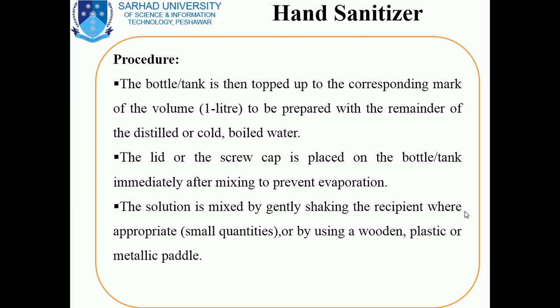The next step is the lid or the screw cap is placed on the bottle or tank immediately after mixing to prevent evaporation. In this step, the lid or the screw or the stopper will be immediately placed on the container or tank in order to avoid evaporation, because the preparation may evaporate.